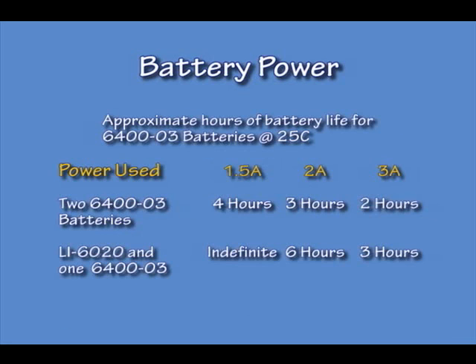Two fully charged batteries should last anywhere from 2 to 4 hours, depending on how many items you are running in new measurements. If you are running the light source and coolers, it should last about 2 hours. However, if you are simply using the clear chamber and do not have temperature control turned on, they should last about 4 hours. The battery charger and one battery will last indefinitely if you are not using the light source or coolers.